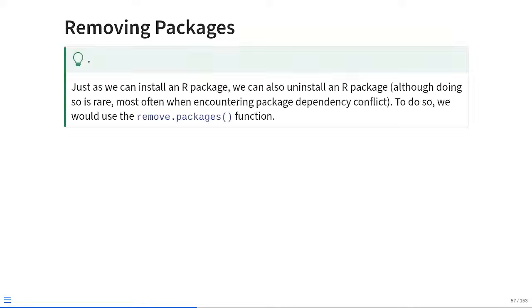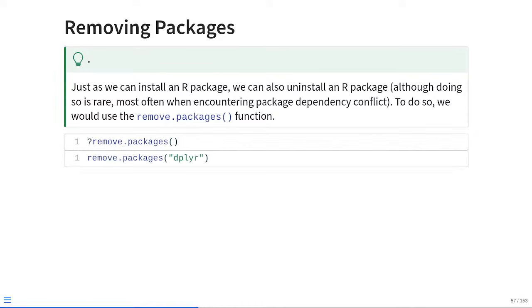And just like this, you can unattach something. If you're installing a package, you can also remove a package. I don't anticipate having to do this very frequently. Oftentimes, you're needing it if you're having a particular package having a dependency conflict with each other, in which case you can remove it the same way you install it, using the remove.packages function, and remembering your quotation marks, the name of the package that you want to uninstall.